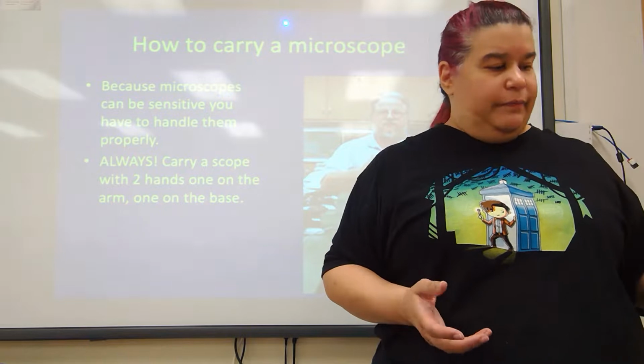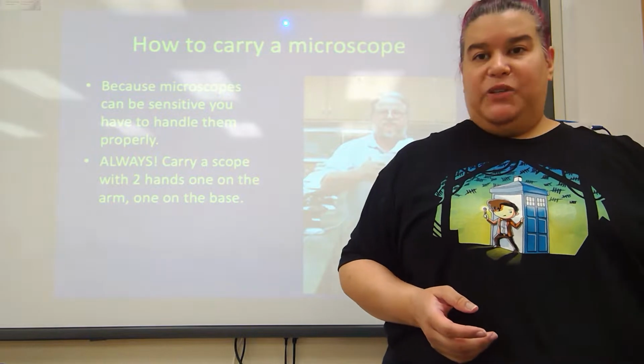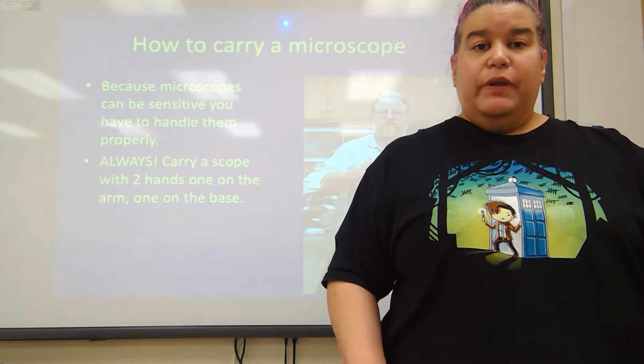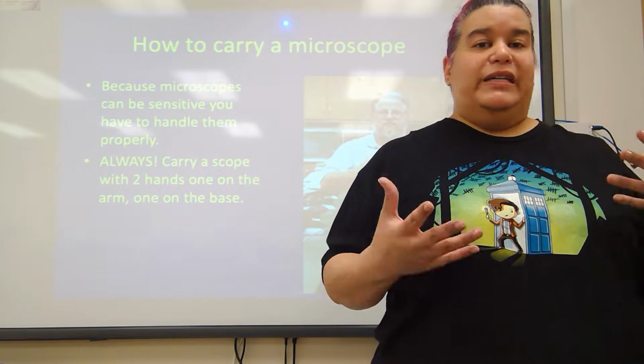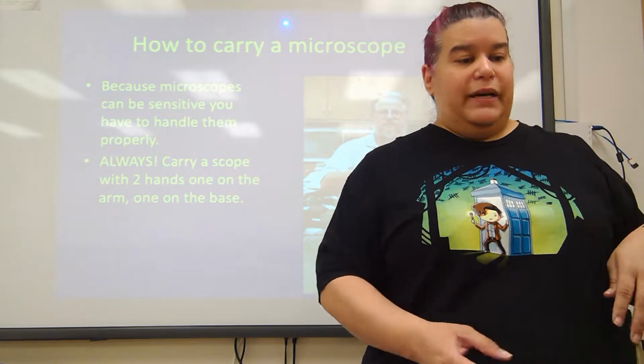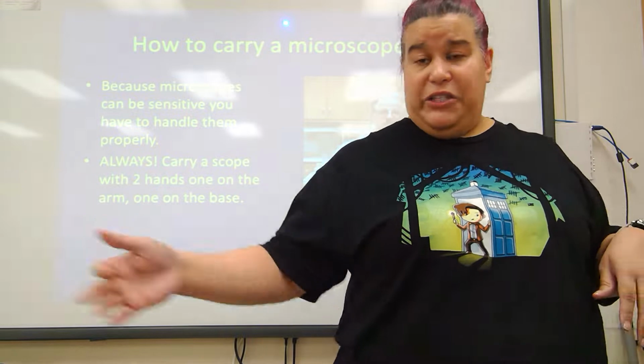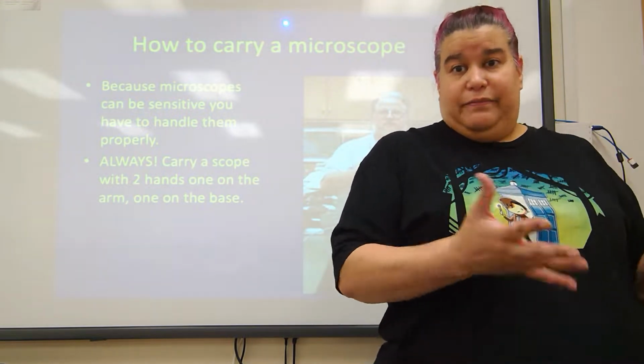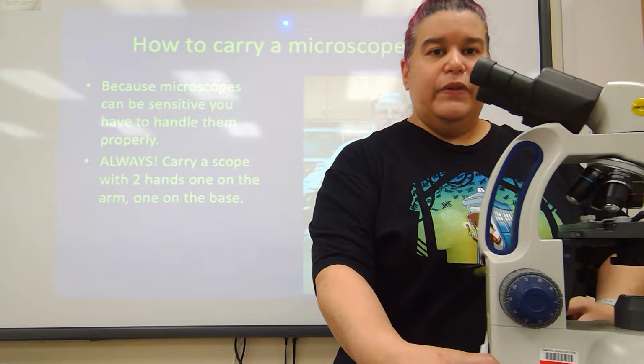Microscopes are expensive. The one that I'm using here is probably between $5,000 and $10,000. So they have to be treated with respect, because unless you have $5,000 or $10,000 that you can afford to buy the school a new one, you have to treat this again with respect.